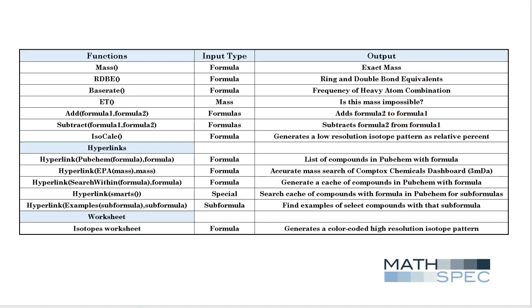And this slide is a brief summary of functions and hyperlinks that are found in our Excel add-in.